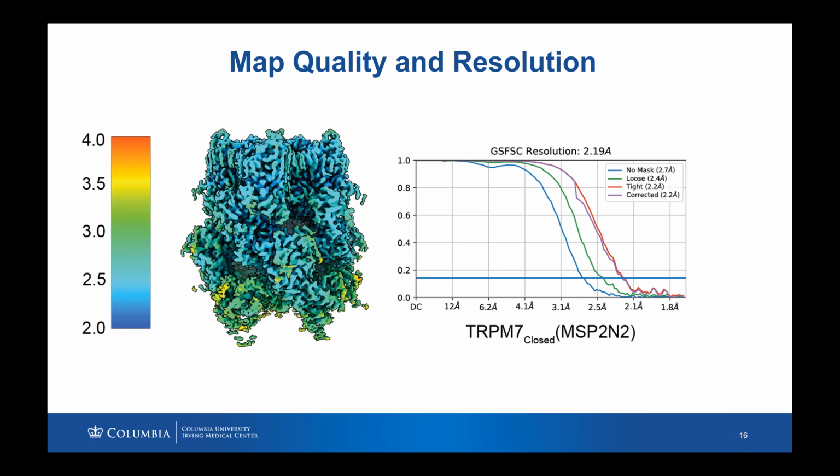But again, in my experience, Bayesian polishing in RELION works really well. And it works, in my experience, way better than local motion correction in CryoSPARC. Although you sacrifice several days to run this Bayesian polishing, you will end up with better resolution.